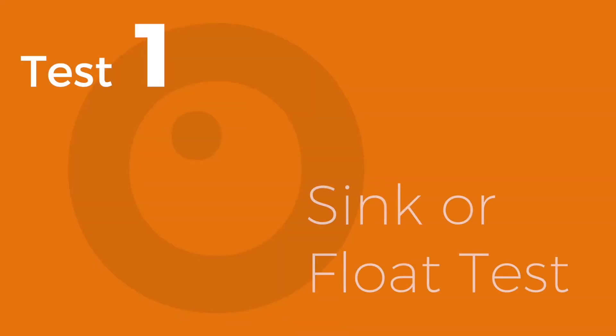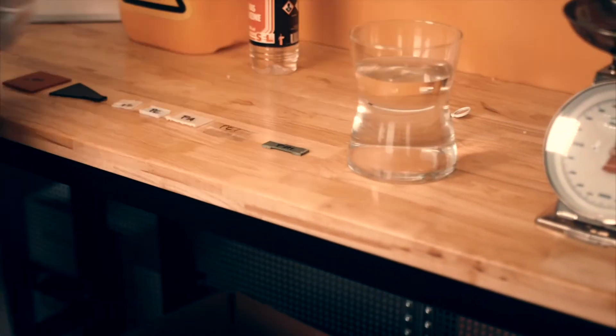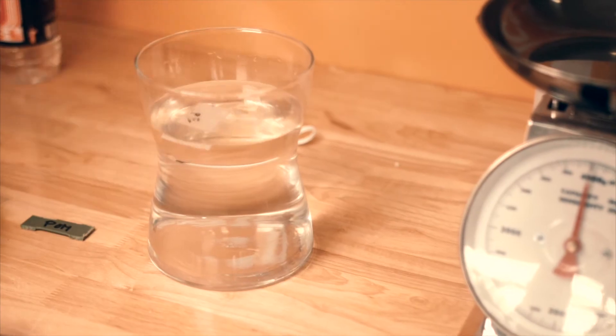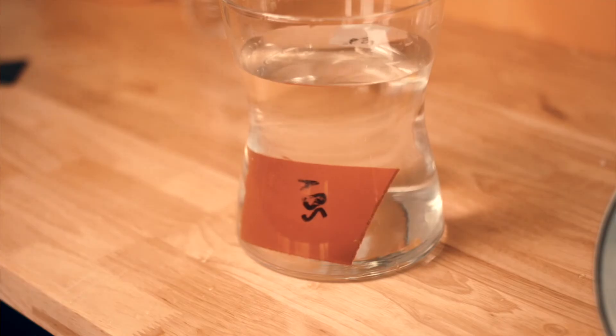Test 1, the sink or float test. This test helps you distinguish between two general groups of plastics. Low-density plastics tend to float such as PE and PP. All other plastics sink because of their higher density.